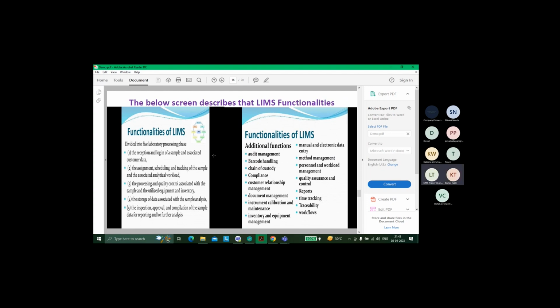Yeah, someone was telling something. Yes, sir. Actually, yeah, it's Kishore, sir. Actually, I have one question. Yeah, sure. Sir, nowadays in QC they are using ELIMS, so will this course cover some part of that ELIMS also? So we'll cover LIMS as a whole. Okay, ELIMS. I did not get what ELIMS is or what part of LIMS. ELIMS means, sir, like balance and ELN?